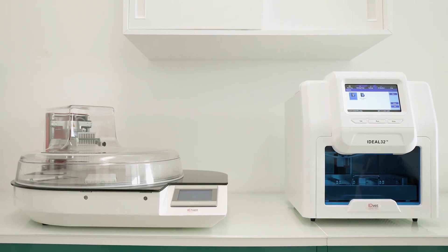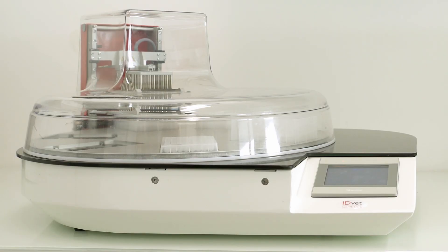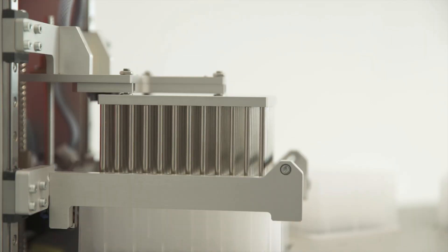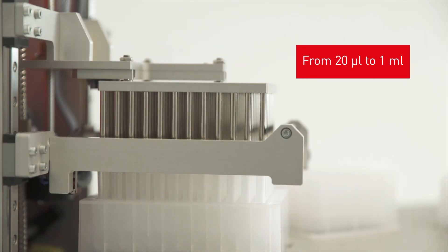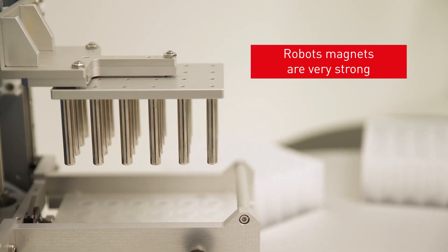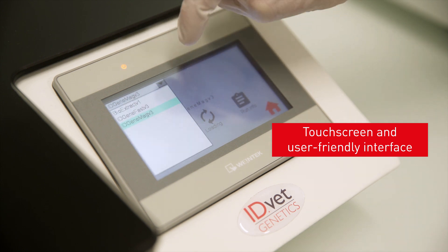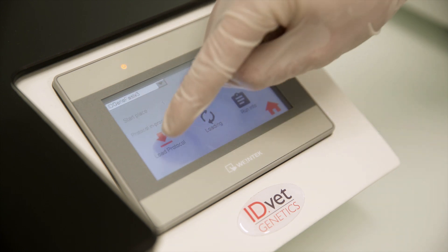More information about the robots themselves. For high throughput testing, the Ideal 96 machine extracts nucleic acids from sample volumes ranging from 20 microlitres to 1 milliliter. The robot magnets are very strong to increase extraction capacity. The device is easy to use with a touch screen and user-friendly interface.